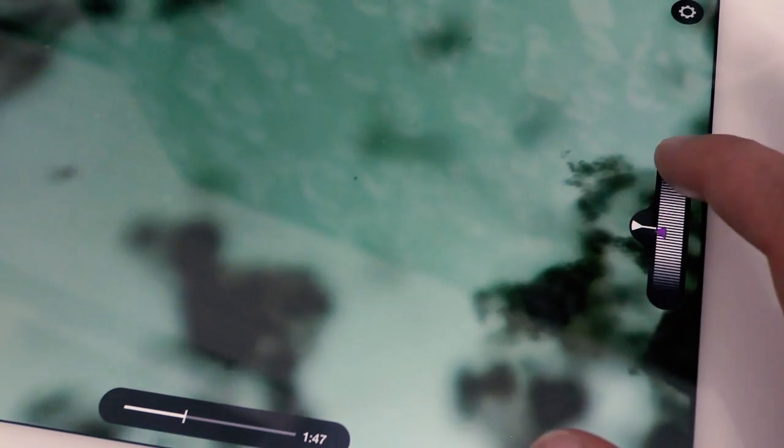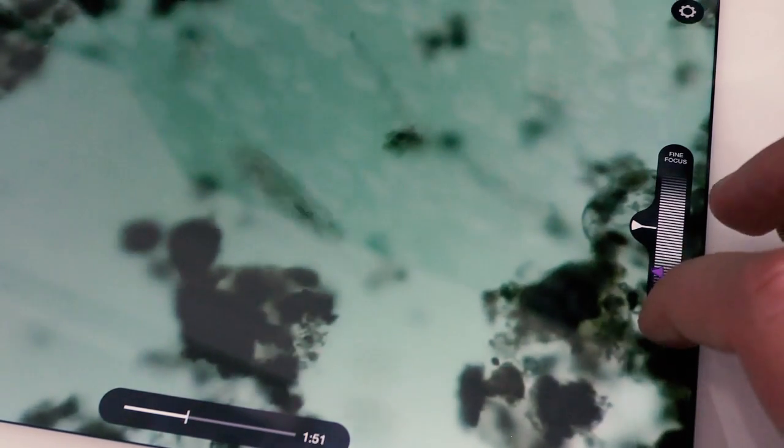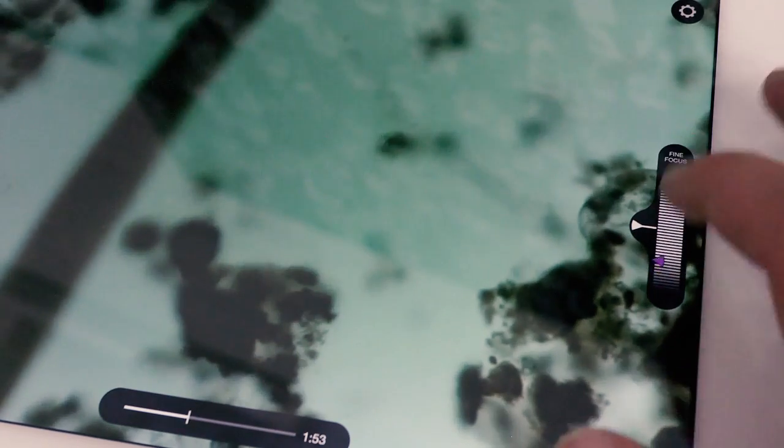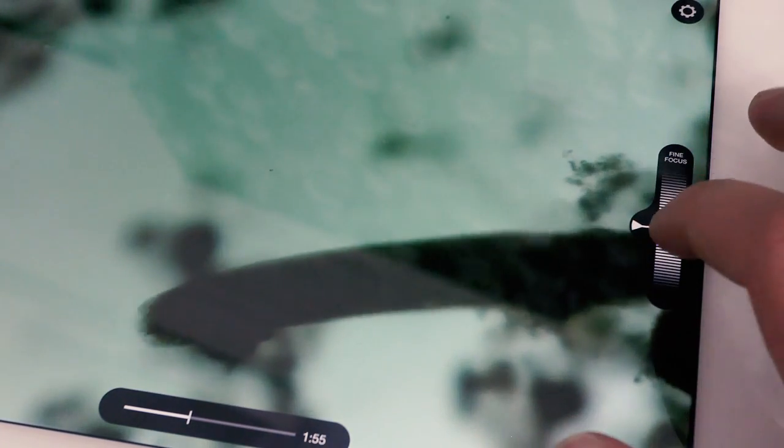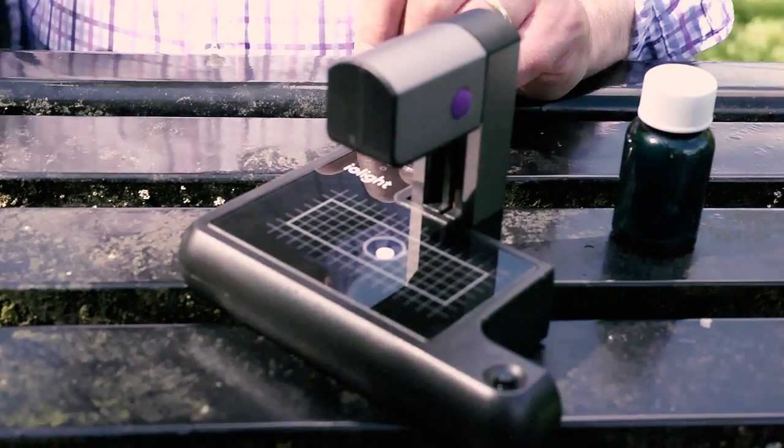There we go. Now we're trying to do some fine focusing, just stroking the fine focus control. Because the slide is half a millimetre deep there's a lot of range of focal planes and you see different things in different layers — and that's just typical of what we see in these lovely ponds on the Millennium Meadow. So today we've seen just how easy it is to use this Iolite microscope out in the field and get fantastic high resolution shots.